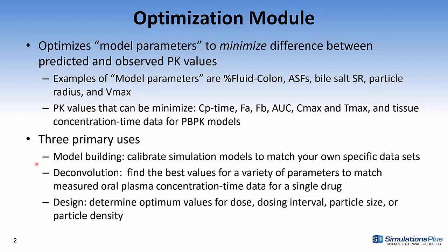Three primary uses of the optimization module are model building, deconvolution, and design. The optimization module can be used in model building to calibrate simulation models to match your own specific data sets. For example, if you had a congeneric series of compounds that had measured fraction absorbed in rat, you could use the optimization module to optimize the absorption scale factors to best fit the fraction absorbed for these molecules.